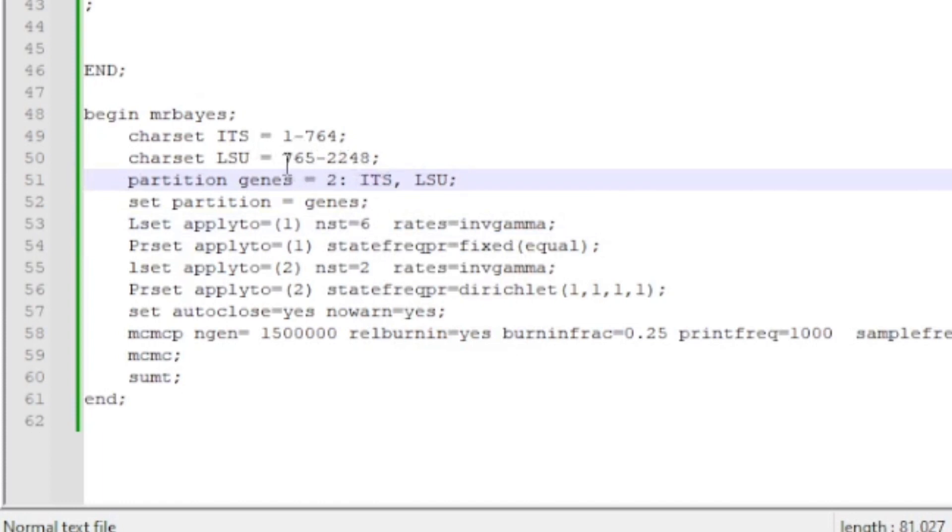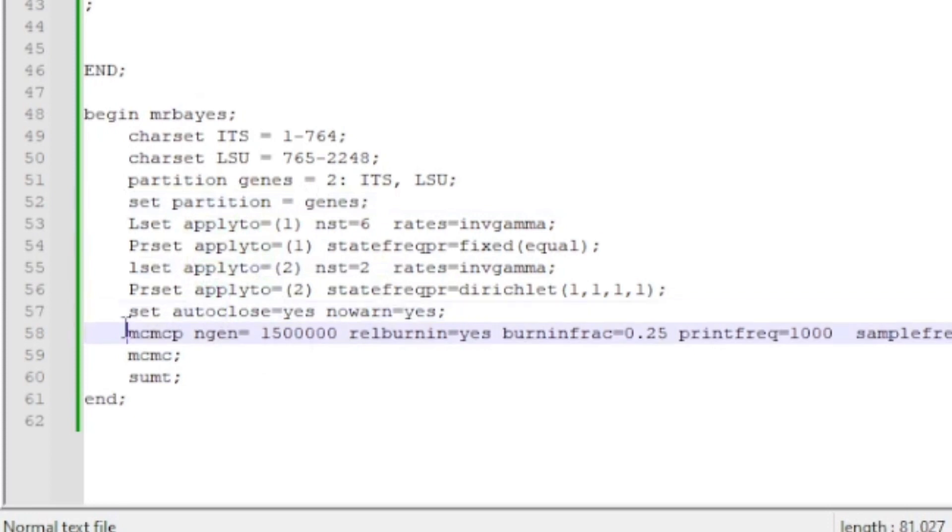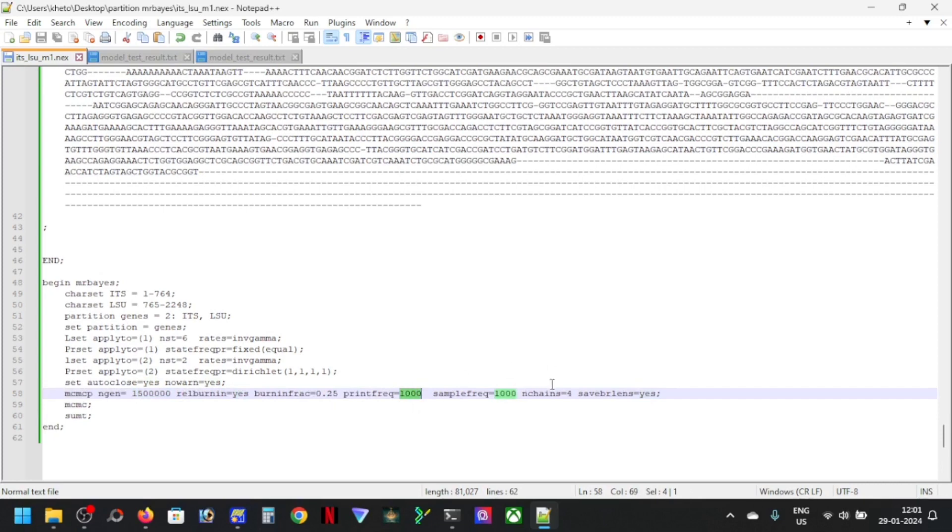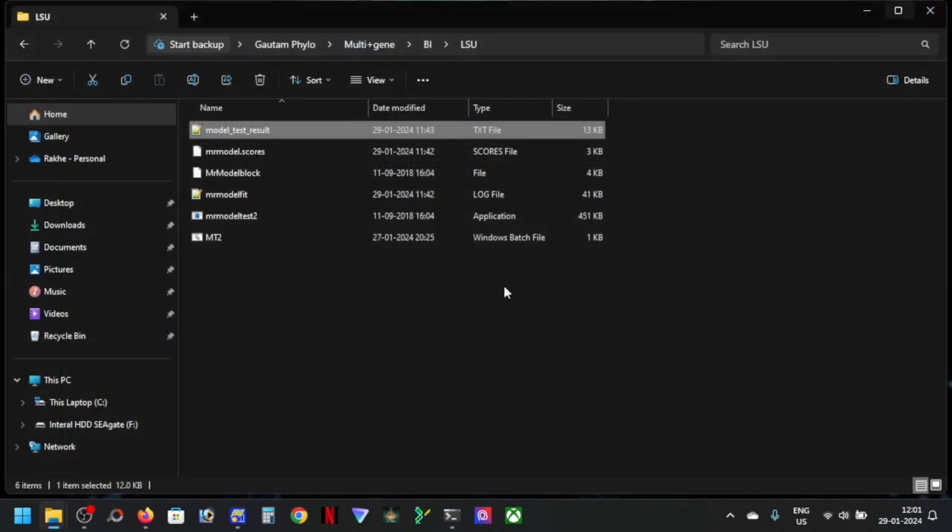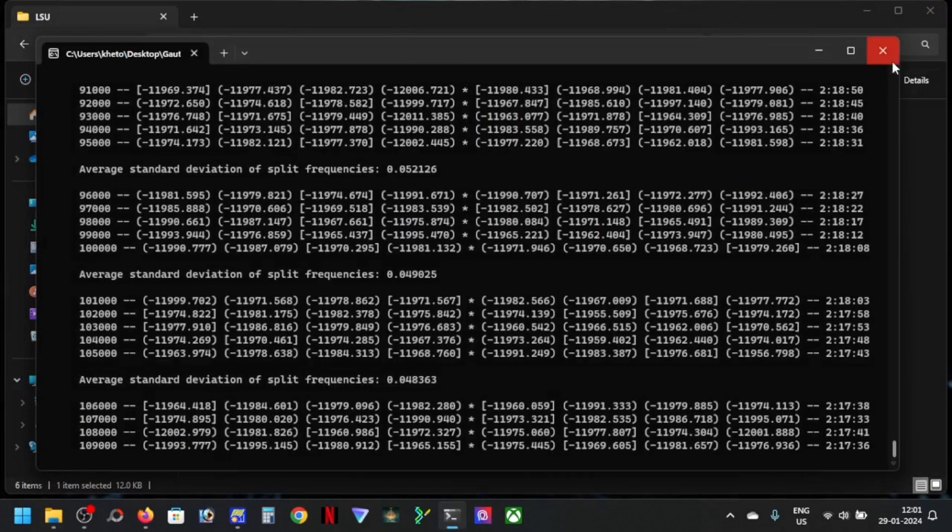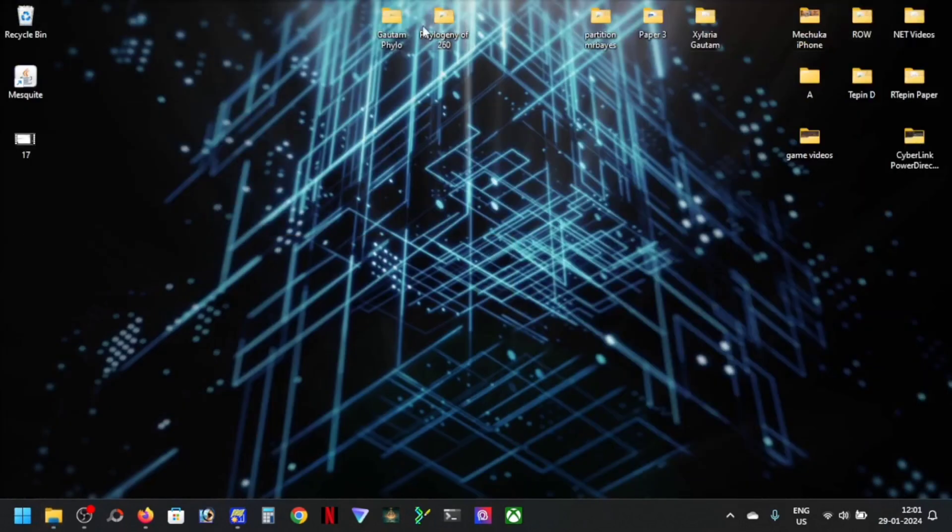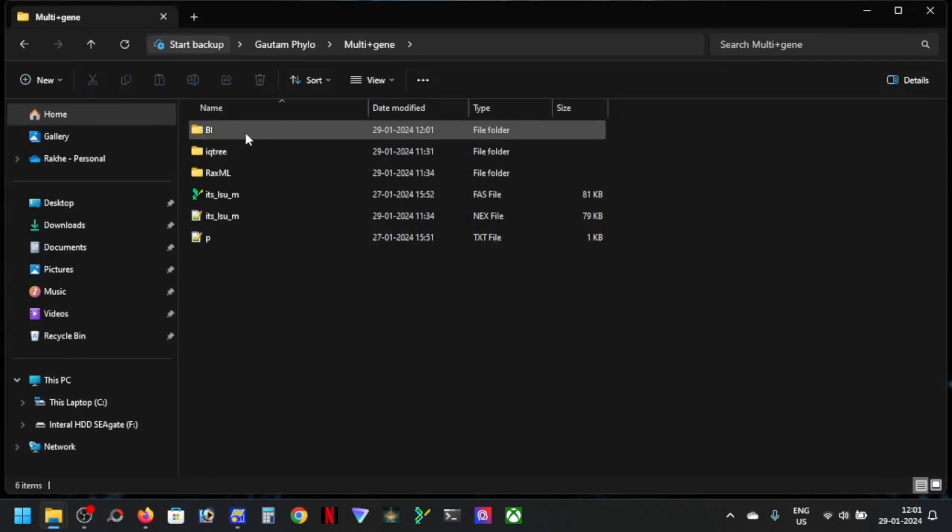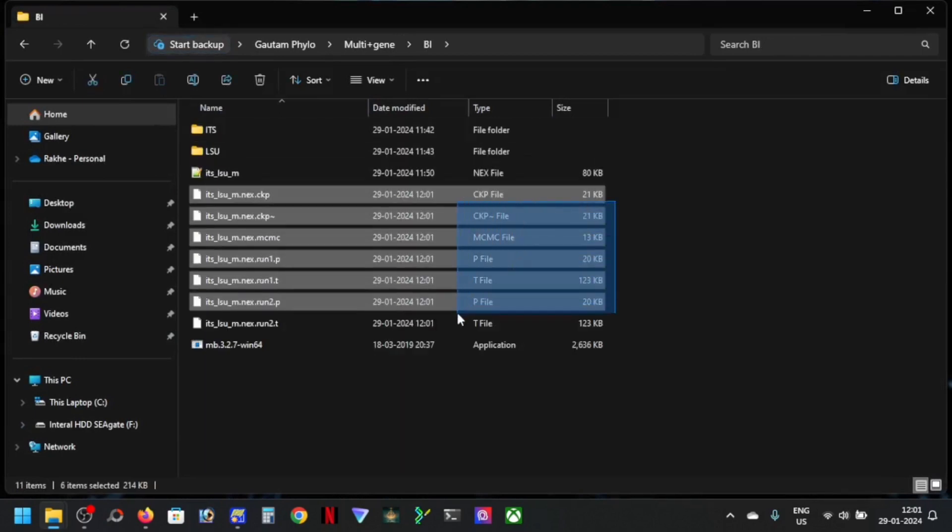After this you can do the same thing, apply to two and preset apply to two, and then set close and then your generation, burn in frequency, print frequency, and this is all that your number of runs, and then you can close this one and then run this.